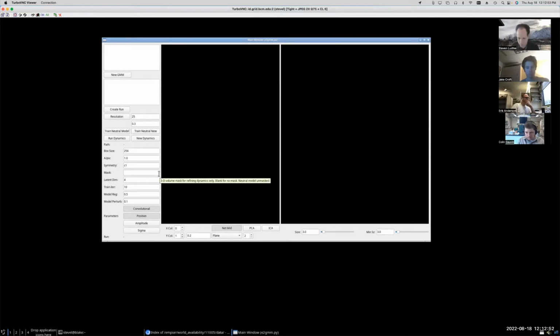If you look at Muyuan's tutorial for the Gaussian mixture model online, it involves using the GMM through a Jupyter Lab session, not through a graphical interface. It makes far fewer assumptions and requires you to understand a lot more about what's going on.